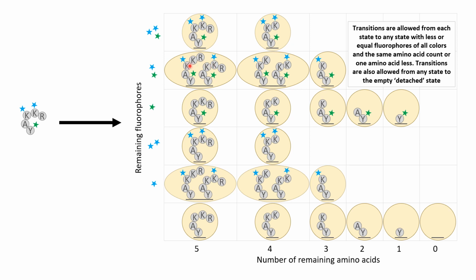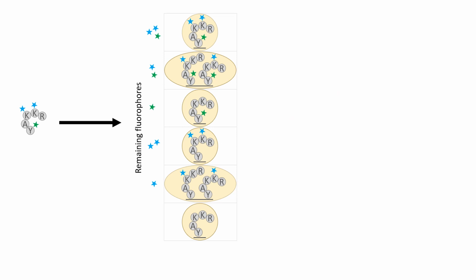So here are these two conditions. A different lysine is labeled on this peptide. And we can do this with no loss in accuracy of the model. To see that, first, let's take a look at this without Edman degradation. And so if we do that, that's relatively straightforward. The position of these fluorophores doesn't matter.